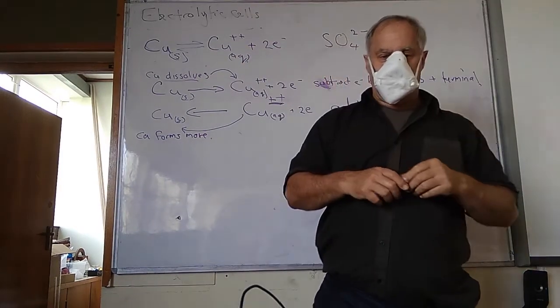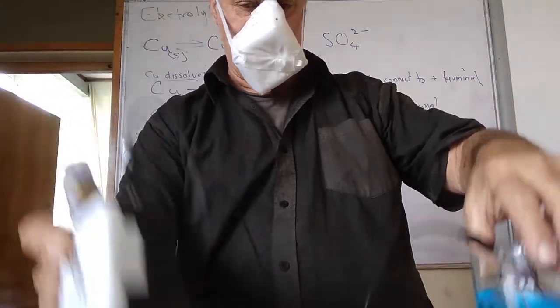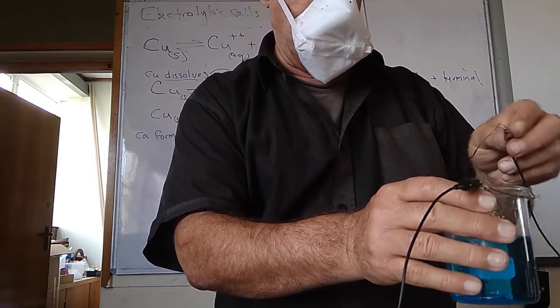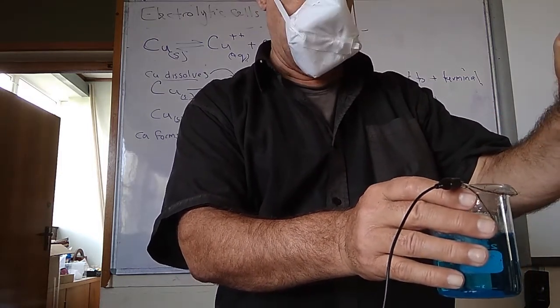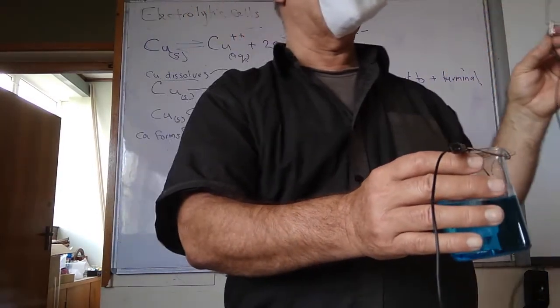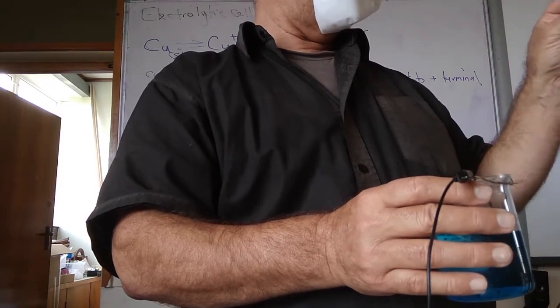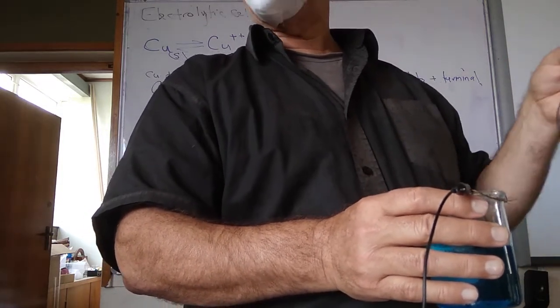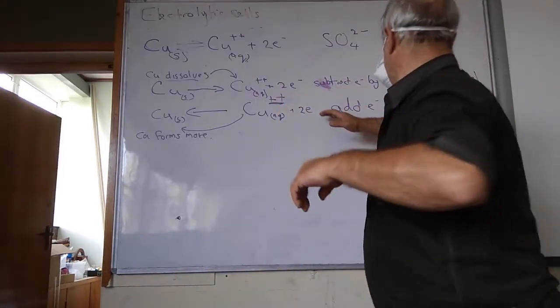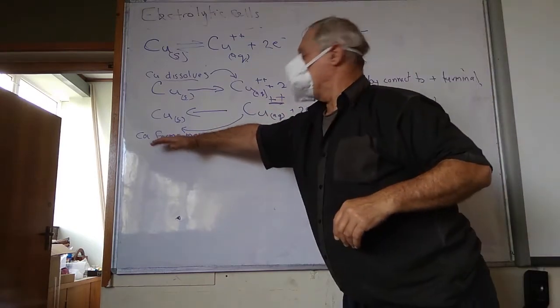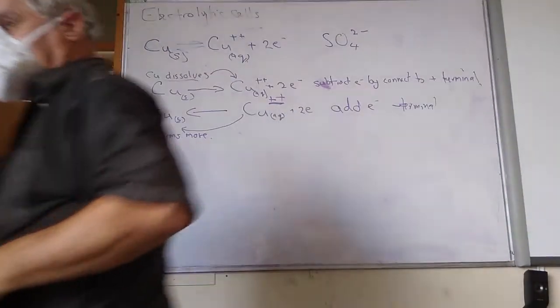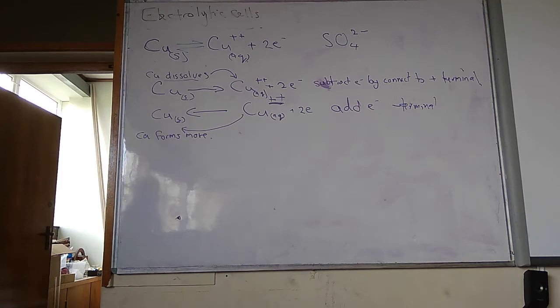Now if you've got two electrodes like this, you can't really see it much. I think I'm seeing some sort of blackish powder that wasn't there before. I'm seeing some black powder form on here, and this is attached to the negative electrode. Is something supposed to form at the negative electrode? So copper is forming. So this stuff that is forming on here must be what? Copper. That's copper. Okay.